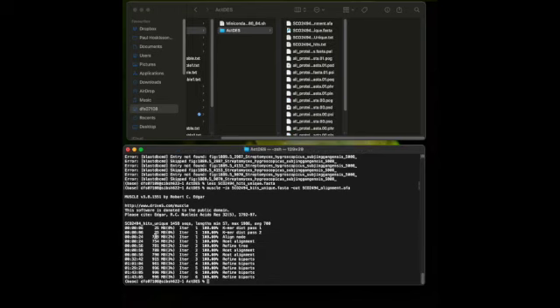Alignment is now finished, and you can see it took 1 hour and 43 minutes because there are 1458 sequences in that, and you can already see that the minimum length of those sequences is somewhere 57 amino acids in length, which tells you they're improper hits, and this is where you need to go back and refine your sequence inputs and your BLAST parameters to make sure you're getting the sequences you require out of the database. The average length of the sequences in the alignment is 700 amino acids.